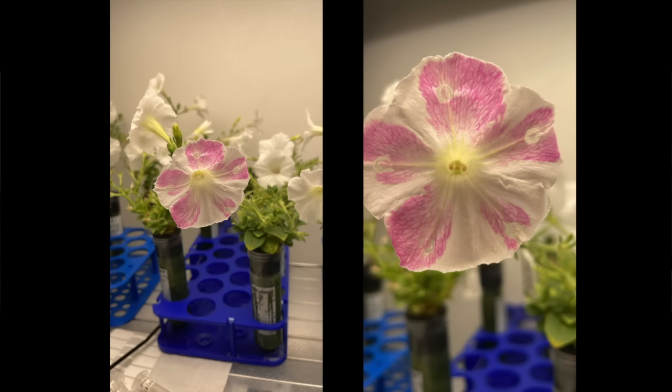And so what's happening is that now you have this spiky, angry Agrobacterium in direct contact with a whole bunch of these cells, right? And so these cells are going to be transformed, and the bacteria is going to transfer the DNA into them. So many of those bacteria are constantly making the little genetic packages and putting them down their little tubes that the general bulk of all of the inserted DNA elements are going to express inside of every cell. It's like a super loud temporary blast of genetic material inside all of these cells. And so you get this really massive signal of whatever you're trying to do.